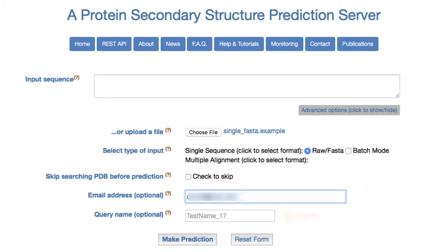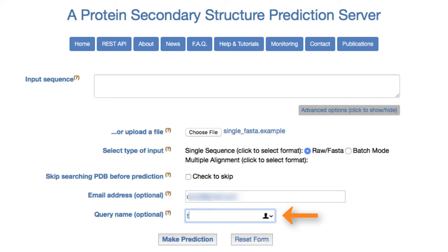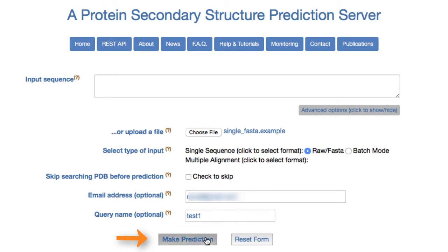The query name is used to identify the prediction. If no query name is given, then JPRED randomly generates a name. Note the query name should be alphanumerical characters. Finally, click the Make Prediction button on the webpage to submit the prediction.